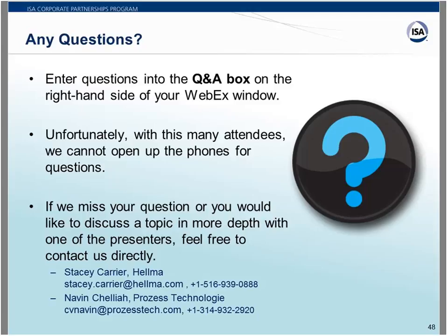So from my experience, of course, more time can be saved by using an inline spectroscopic instrument when it is incorporated into a manufacturing process line. And this time includes substantial time spent in the lab to analyze or test the product. And while we wait on the results, we lose more time which can be used for shipping and marketing. If you want to do a Karl Fischer titration in the lab, you stop the process, you get the sample out, and then you take the sample to the lab, which again takes more time.